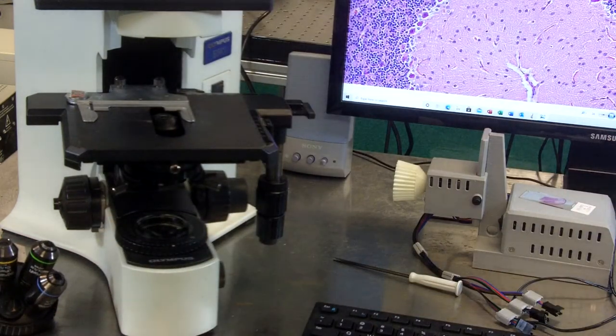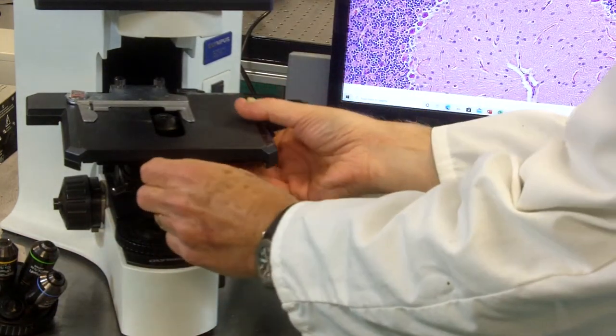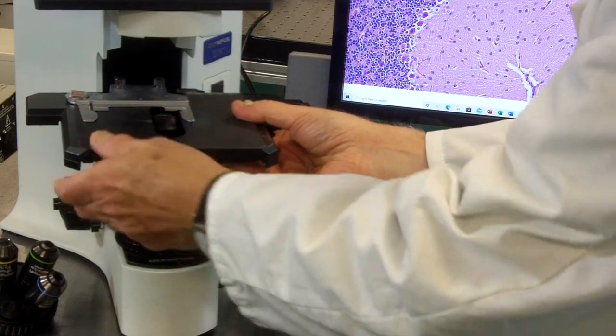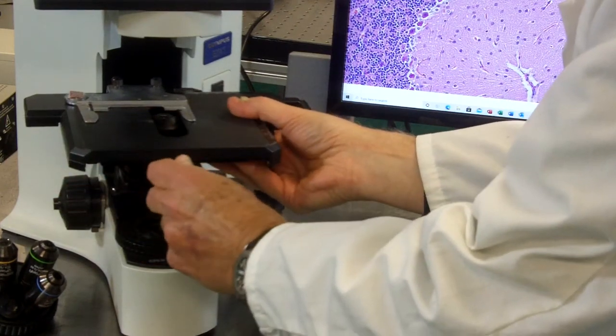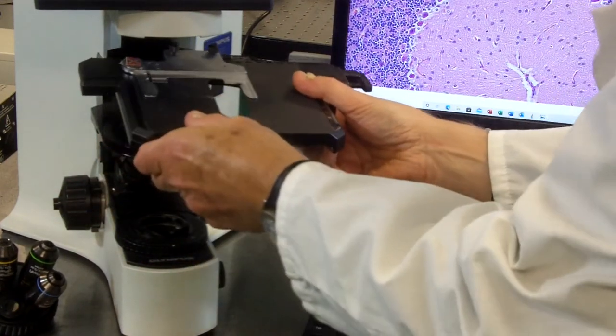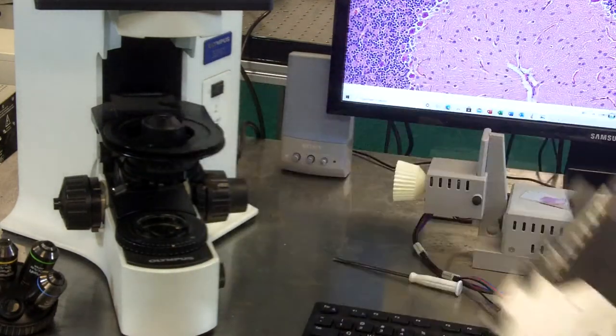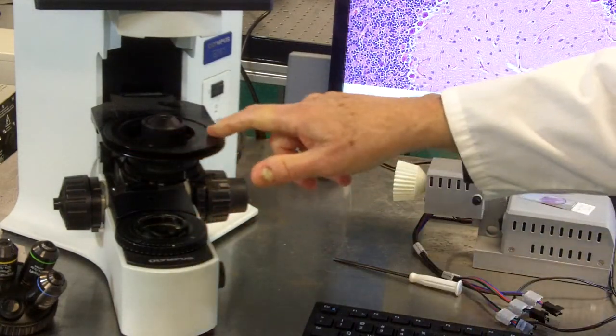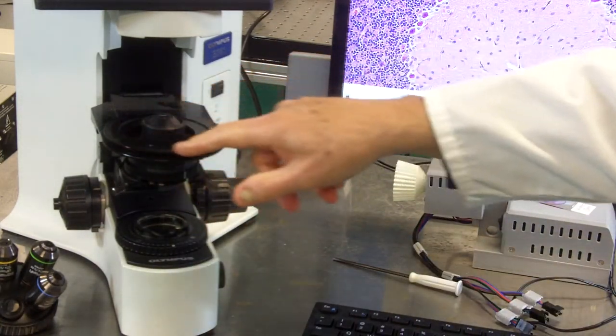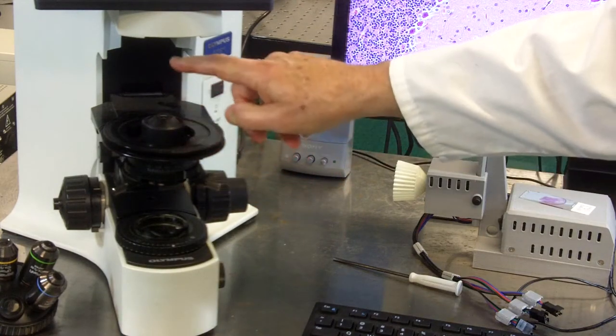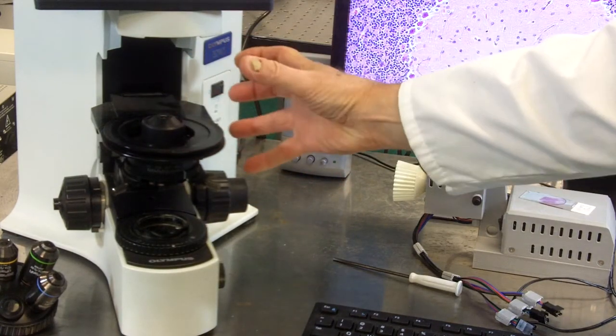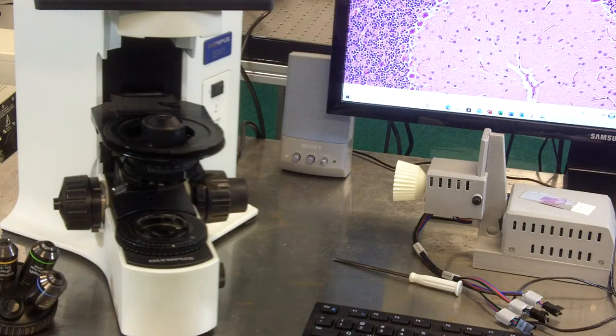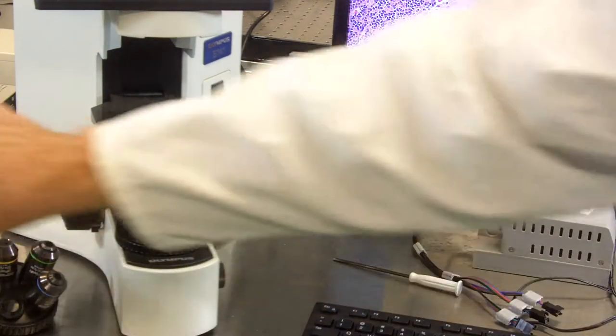The next thing we're going to do is remove the existing manual mechanical stage. As you'll see, the stages are mounted to a ring that is connected to a bracket that's connected to the focus block. We'll put the stage aside.